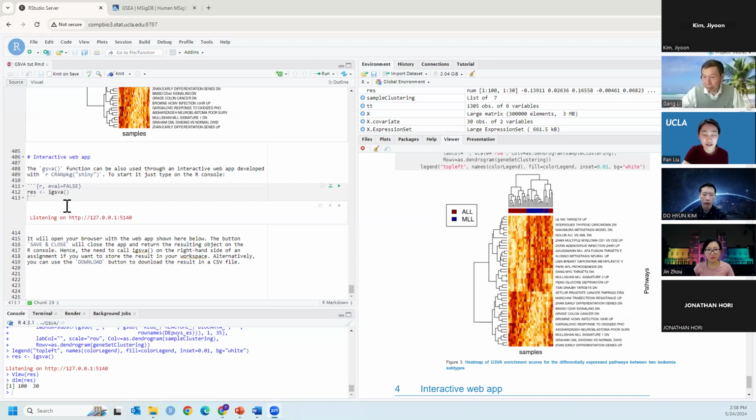So you mean it won't change the final result, like the differential pathways? No matter what kind of normalization method, the downstream pathways declared to be enriched will be relatively consistent across different normalization methods? Well, that is a very good question. I haven't tried that for different normalization methods. I'm sorry for that. Great tool. You guys did a lot of work, and it's very wonderful. Thank you so much.